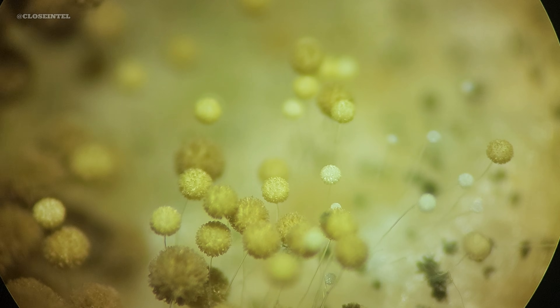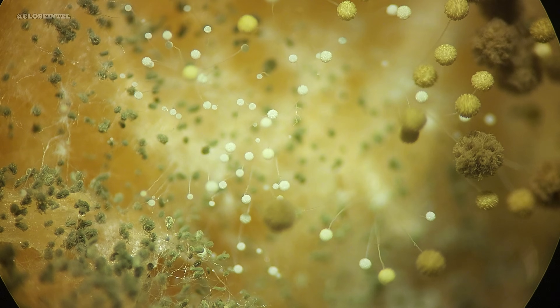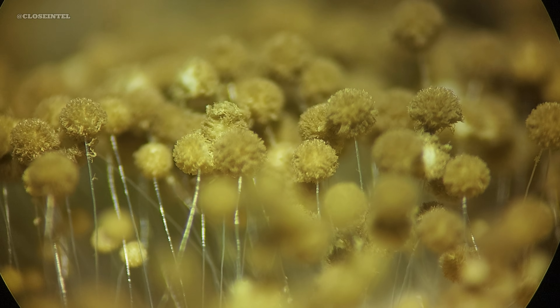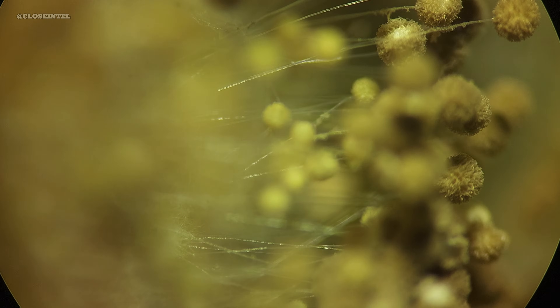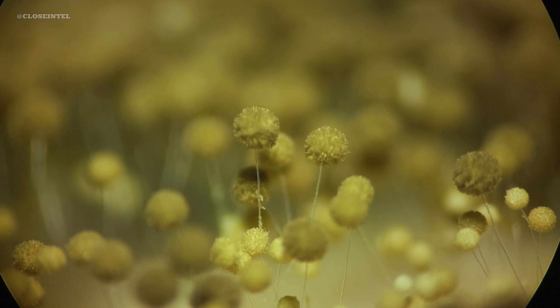Identifying the exact genus and species of mold can be really tricky to say the least without special tools. Just by looking, you can't tell for sure which mold it is because many different kinds can appear similar in shape, size, and color. To know for certain, you need to use special stains to see details under a microscope or send a sample to a lab for DNA testing, which can get expensive.